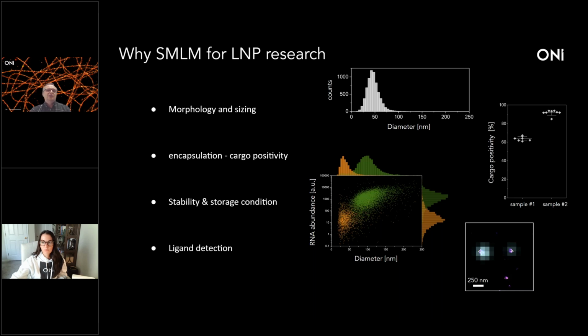The second option is you just perform the same labeling as you would do for any confocal imaging for any receptor. For example, if your ligand is a human antibody, then you can use a secondary Fab2 fragment against human, labeled with the fluorophore. In the example which I showed you, we use a 560 channel to detect the ligand. So there are a lot of options which we can explore, and we can customize it depending on your ligand and your targets.